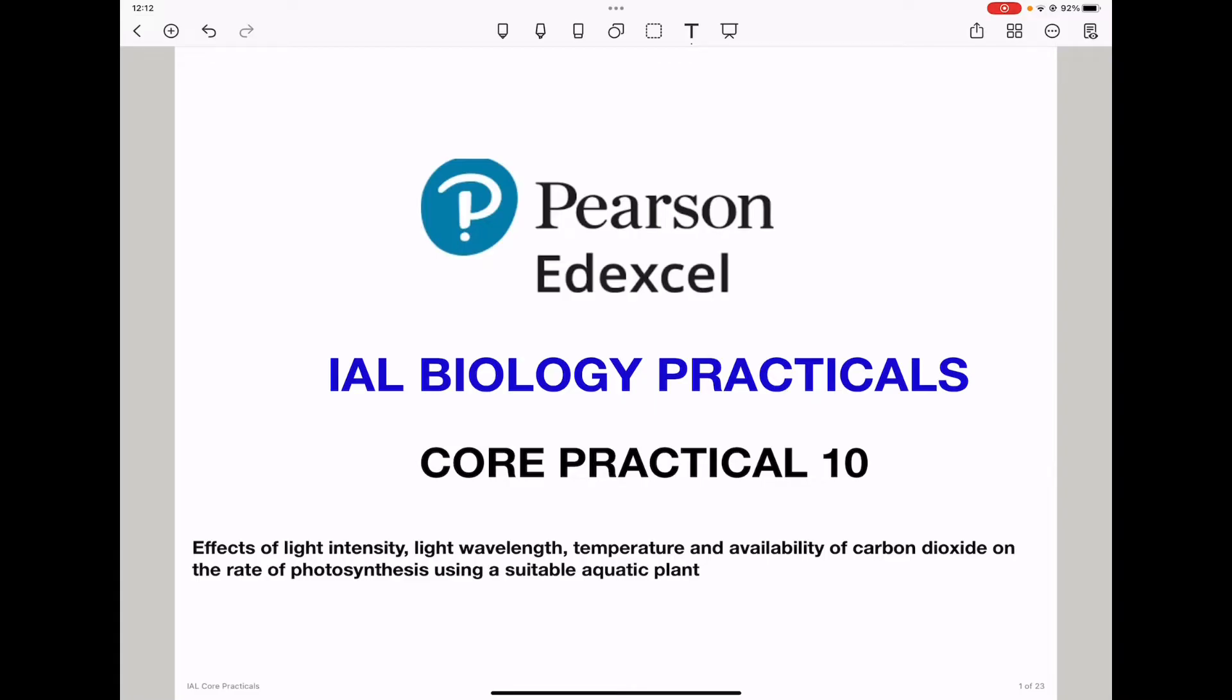Here we study the effects of light intensity, light wavelength, temperature, and availability of carbon dioxide on the rate of photosynthesis using a suitable aquatic plant. I have separated this practical into four different videos: one studying light intensity, another studying light wavelength, another studying temperature, and the last one studying carbon dioxide concentration. So let's begin with the first experiment.